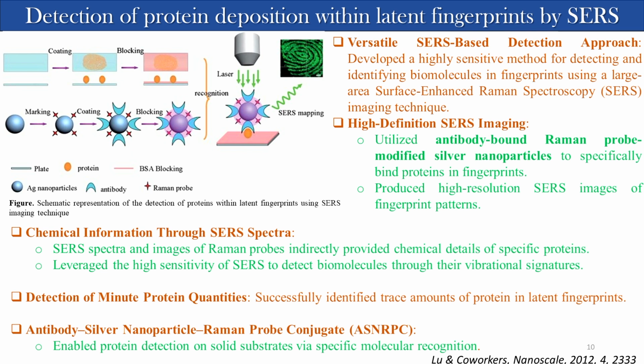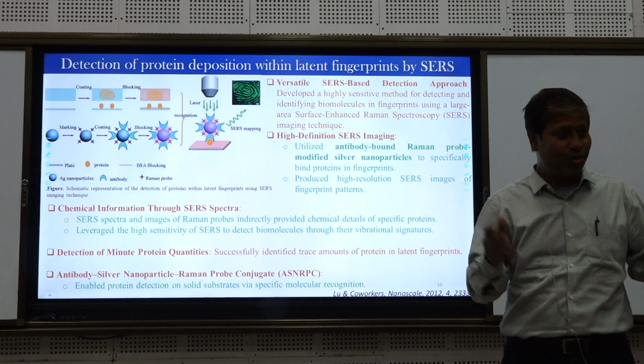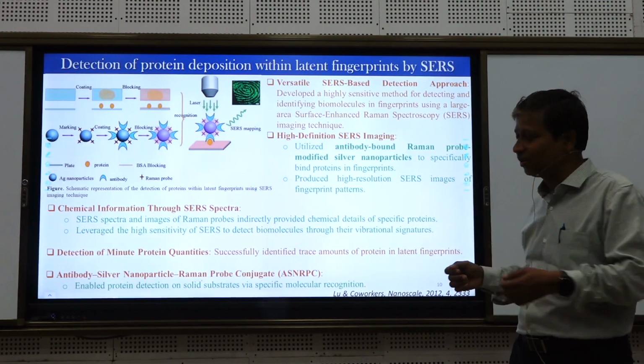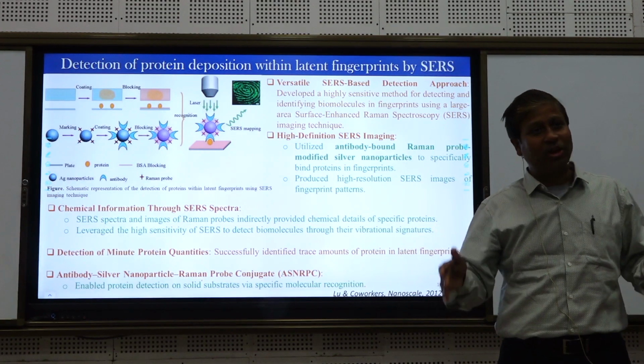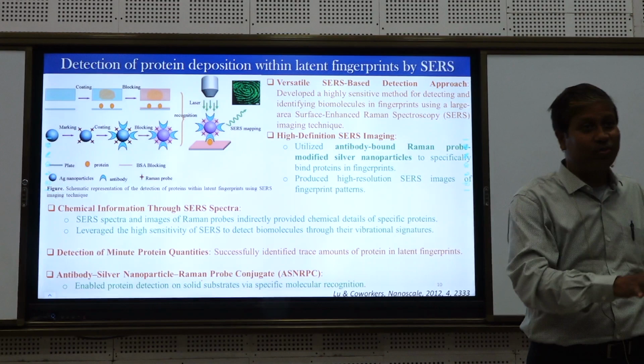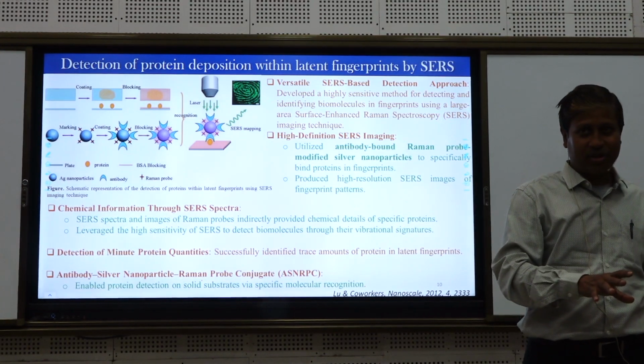One group, I think from Netherlands, was quite big, maybe 15 people in the last slide they showed. So the whole group is working on how to get information from apparently non-informative spectra.